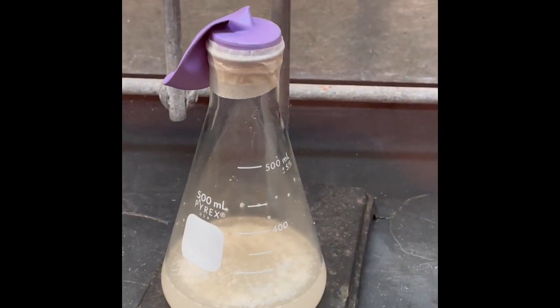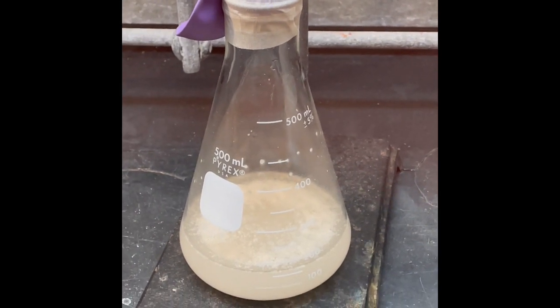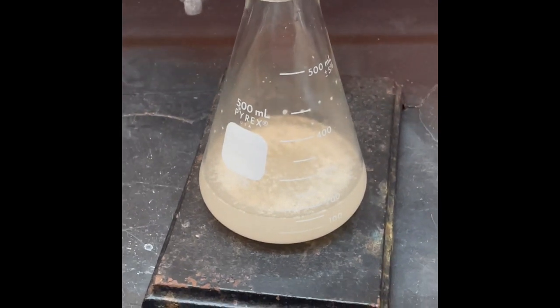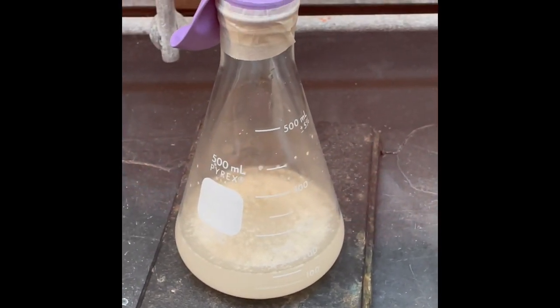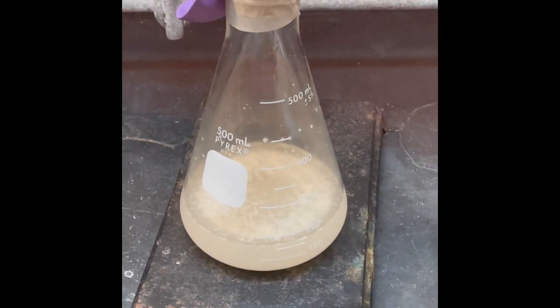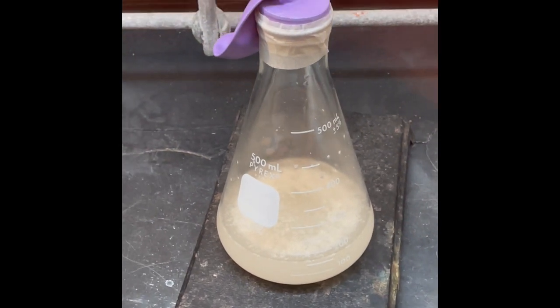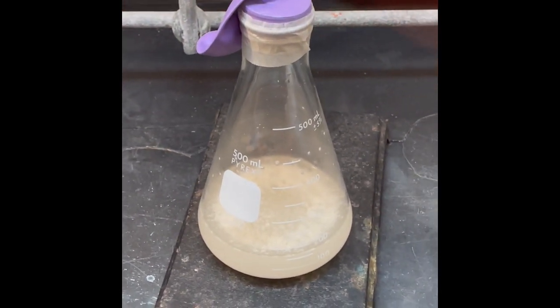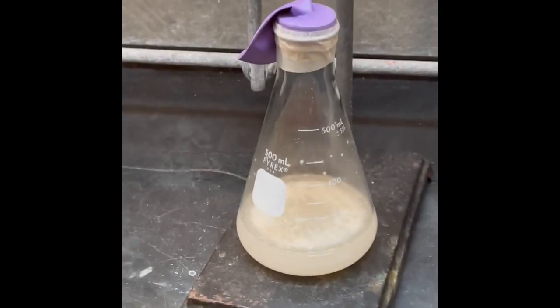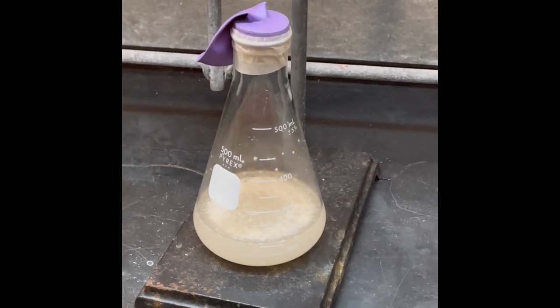Put a balloon over the top, so that when carbon dioxide forms during this fermentation process, it has somewhere to go, because that balloon will expand, but oxygen cannot go into this system. We don't want oxygen in there for further oxidation of our products. So that's why that's there. You can also set up a barium hydroxide bridge, but this isn't using barium hydroxide and it's less toxic. So I went that route.